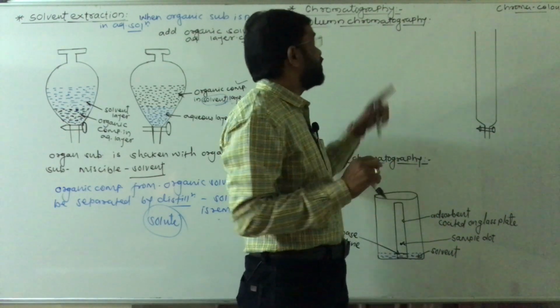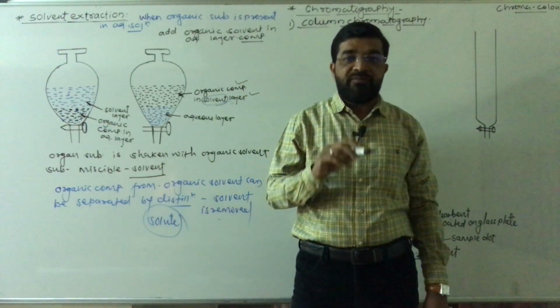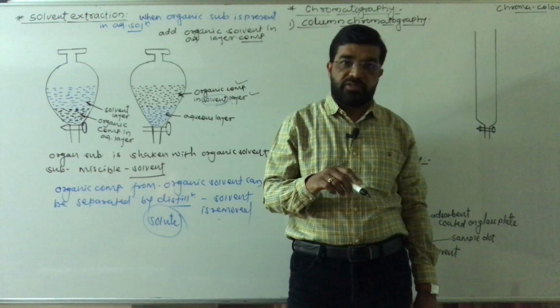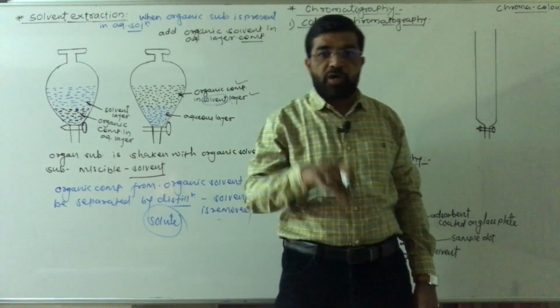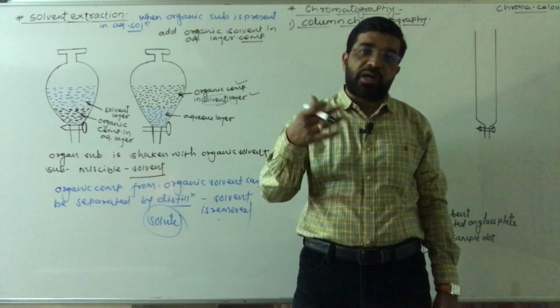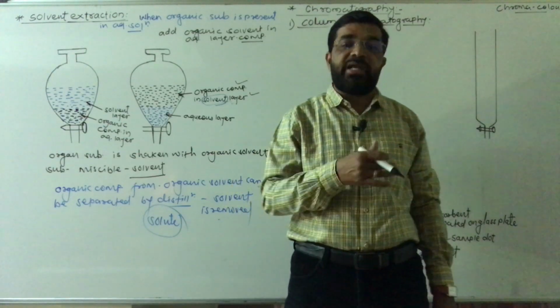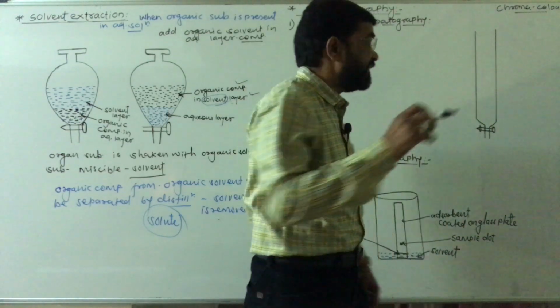This chromatographic technique consists of two phases. One is the mobile phase and one is the stationary phase. The stationary phase acts as the adsorbent, and the mobile phase contains the mixture of components, and that mixture of components is separated by using this adsorption chromatography technique.